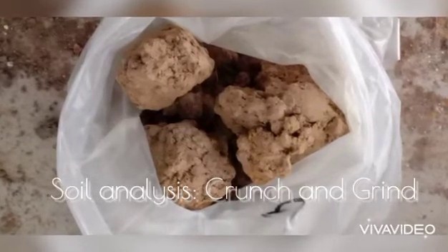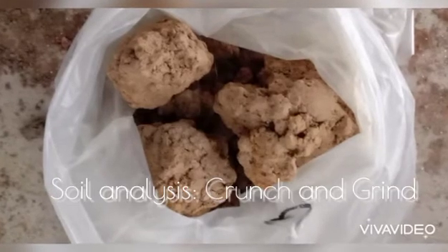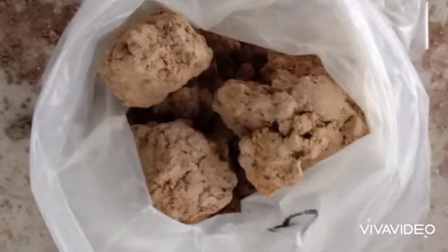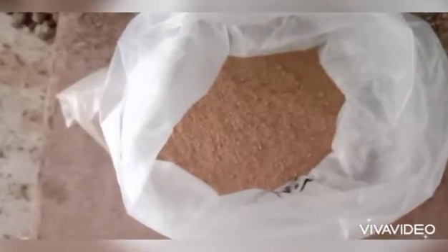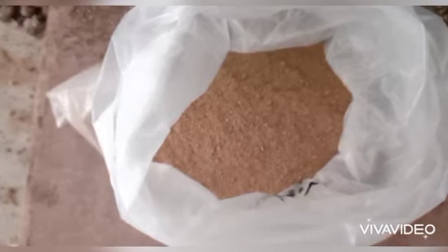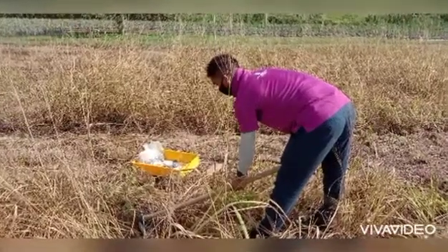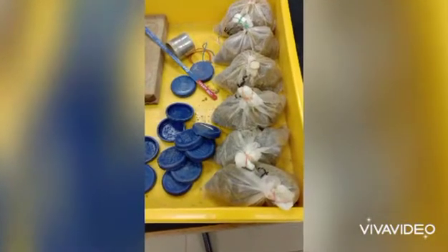Hello, hi everyone. In this video I will show you how to turn your raw sample, which is your field soil, into fine texture that is suitable to be used for soil chemical analysis. This is the soil sample that I took from my field. This soil I intend to check its chemical properties such as pH.